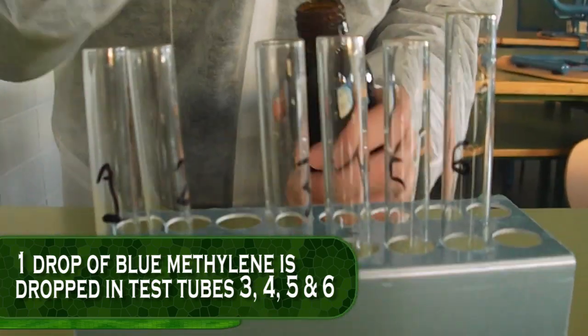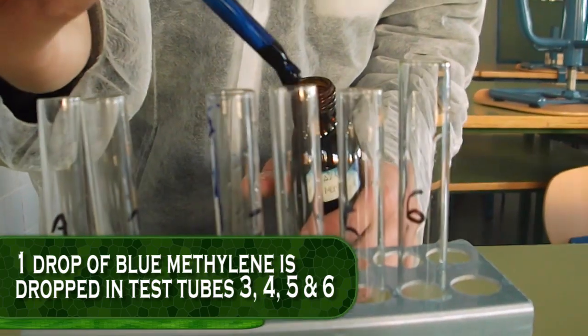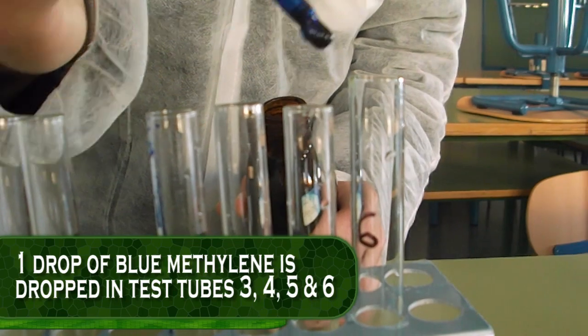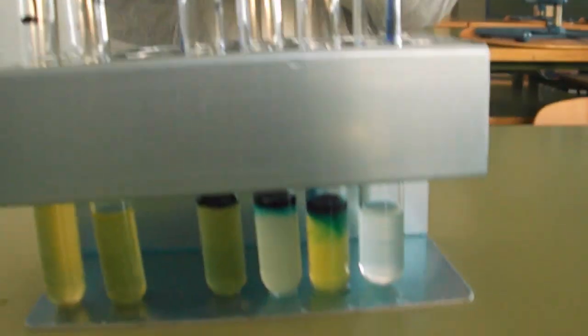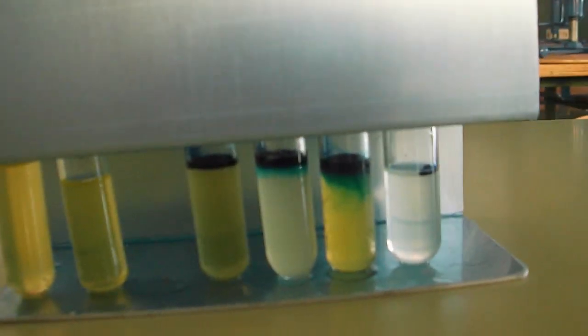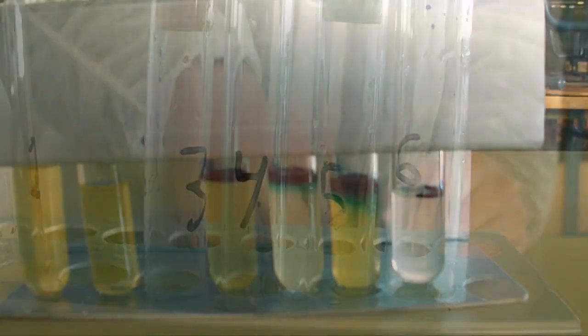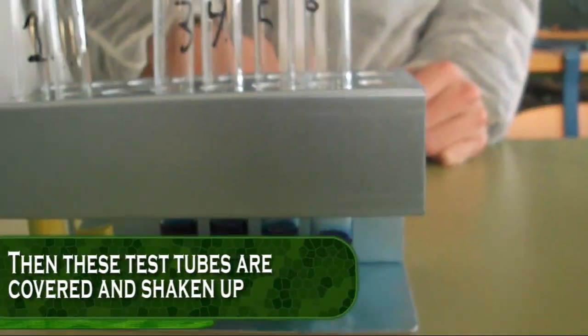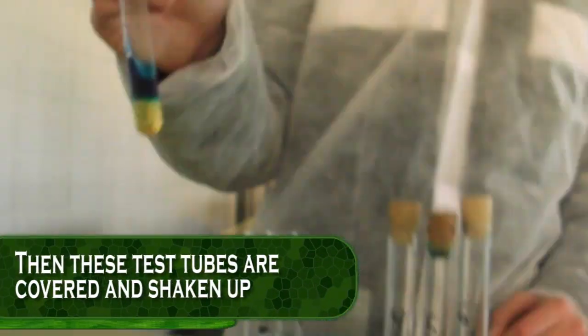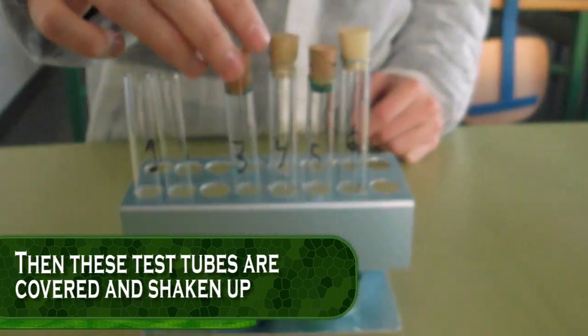One drop of blue methylene is dropped in test tubes 3, 4, 5 and 6. Then these test tubes are covered and shaken up.